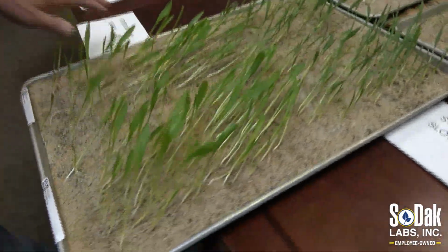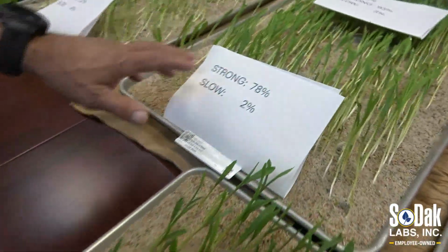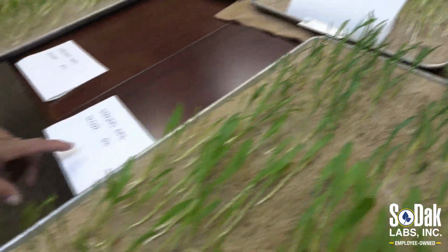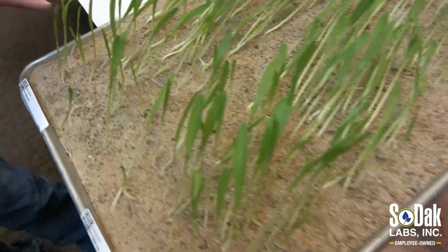The front rep here, which is our strongest lot of sweet corn, it had the strongest warm and the strongest cold, comes in with, in essence, a 70% accelerated aging. So a different type of stress and 70%.